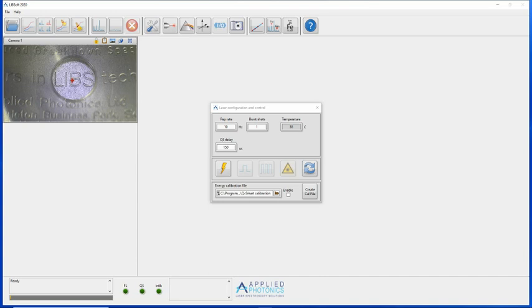At the top of the laser configuration window there is a continuous display of the laser temperature and the parameters that control how the laser operates. The repetition rate parameter allows several discrete rates up to and including the flash lamp frequency of the laser to be set. This is the repetition rate at which the laser will fire a burst or continuously if the manual laser controls are used, and also while acquiring spectra.